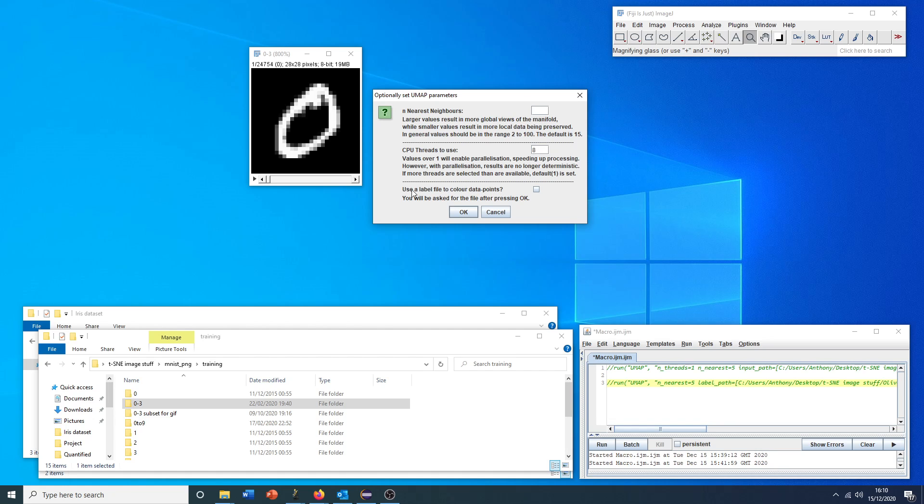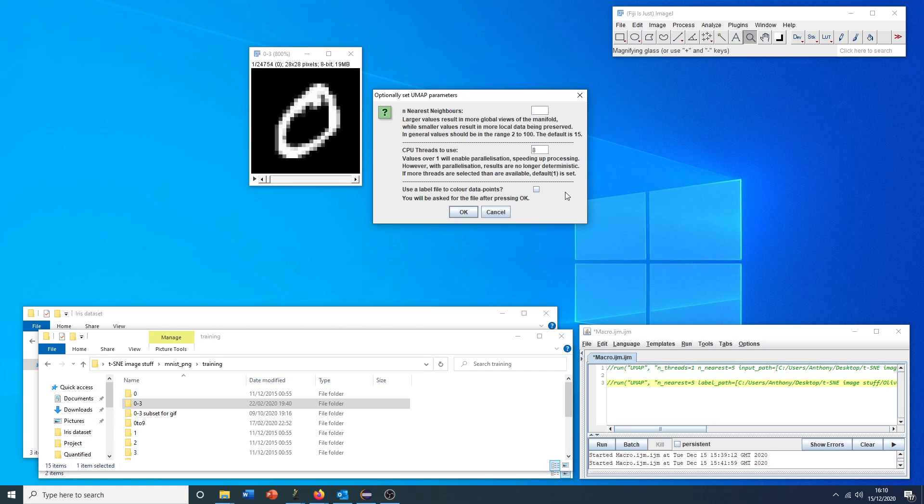With this number of images, it shouldn't take that long with a single thread. Also, just a note, we only get a guaranteed deterministic result if we run one CPU thread. Otherwise, there's some randomness built into the algorithm with multiple threads. That means the output will vary ever so slightly between runs. We'll run with eight here.